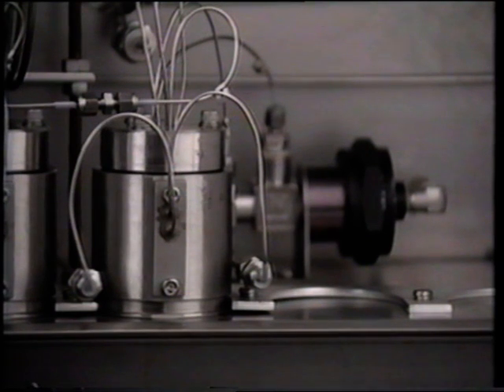The diaphragm valve consists of 6 ports and 6 plungers, which are arranged in a circular pattern. Alternating sets of 3 pistons and plungers channel a sample from the sample loop into the carrier loop, where it is swept into the column.